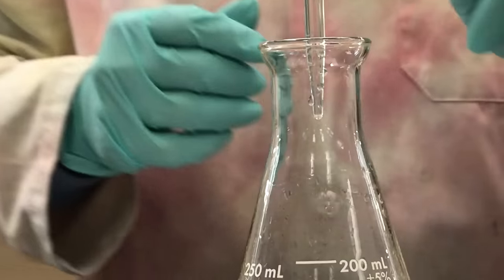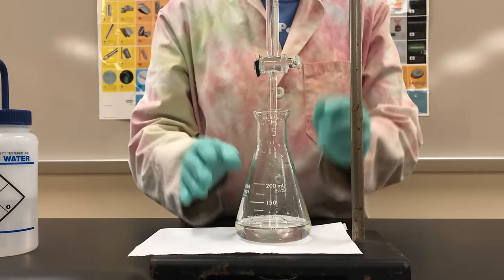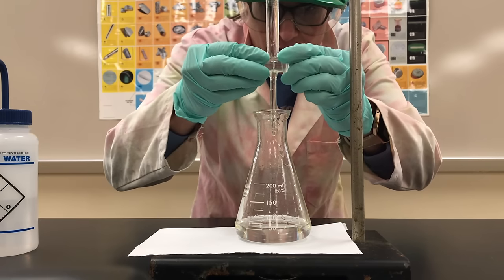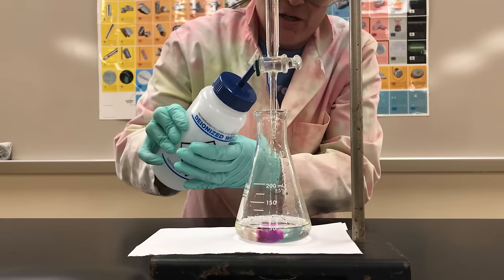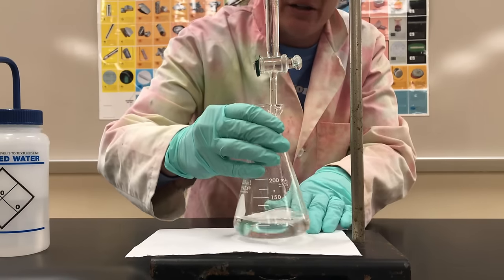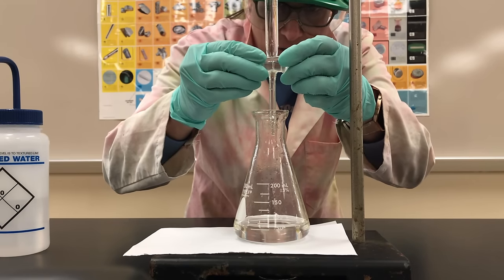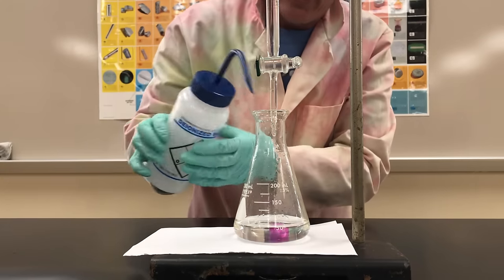You know you're getting close to the end of the titration when this pink color persists longer and longer. Once that pink color persists longer, you will want to again try to add only a drop at a time. We are very close to the end of this titration. That's one drop that went in, and another drop I'm going to add in through the tip of the burette. You can even touch the side like that. You'll swirl it, and you can really see how long that pink color is persisting. So again, we want to go very slow at the end of the titration so that we don't miss the end point with the indicator.